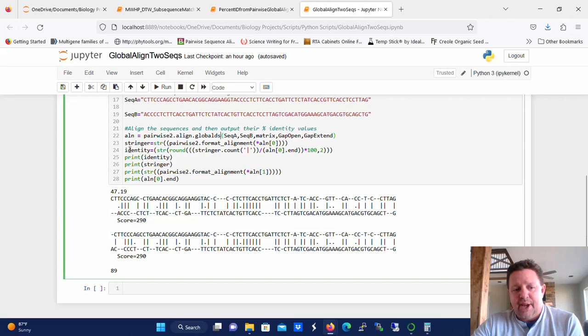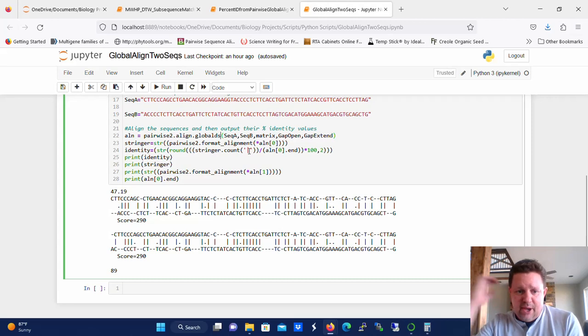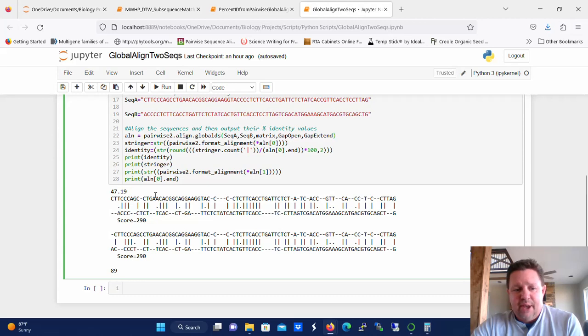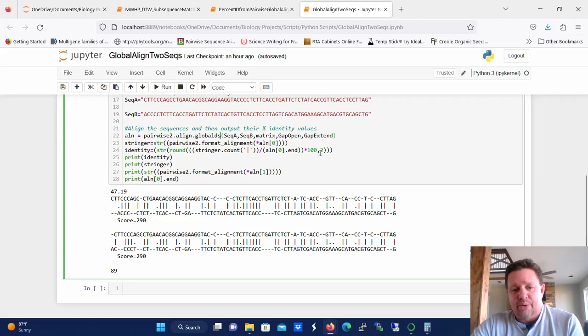We want to calculate the percent identity. So we're going to call that identity. We're going to define it. And we're going to round it to two decimal places. And we're going to calculate the percent identity by counting the number of pipes in the alignment. So if we skip ahead a little bit and we look at the alignment down here, this is the top alignment. The pipes actually show identities. So that's going to tell us the number of identical residues by the length of the sequence, multiply that times 100, and that gives us the percent identity. And we're going to report that to two decimal places.